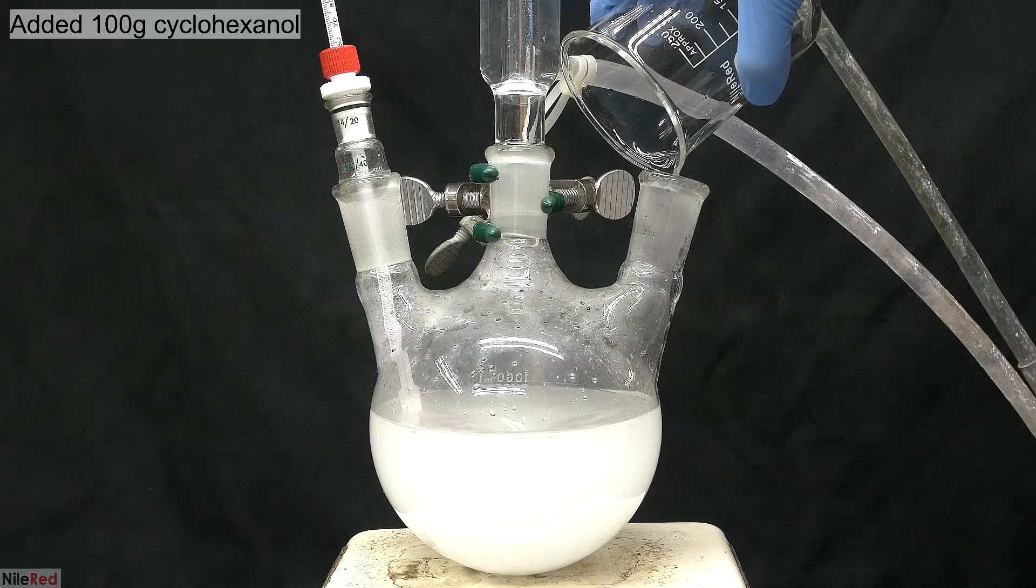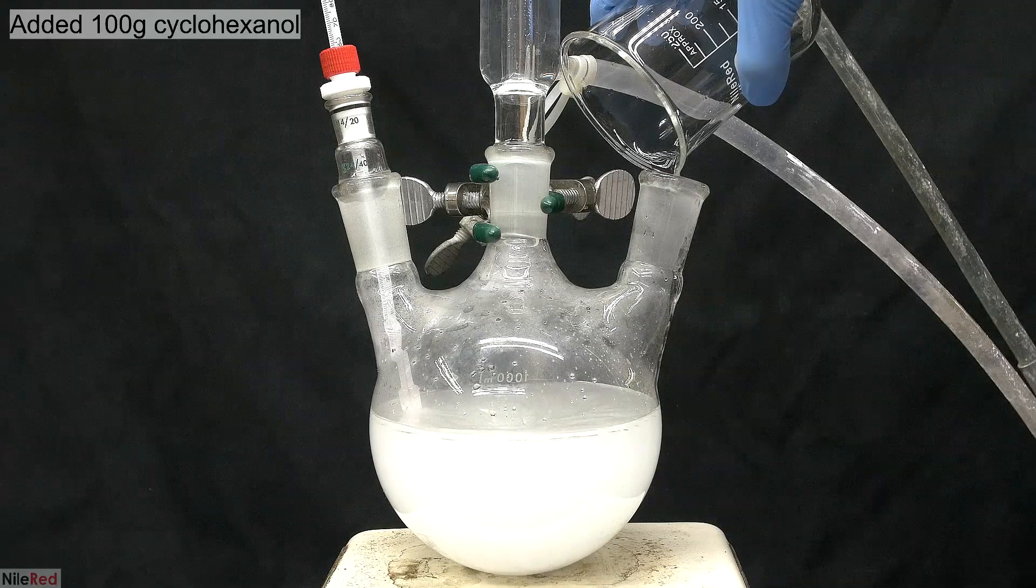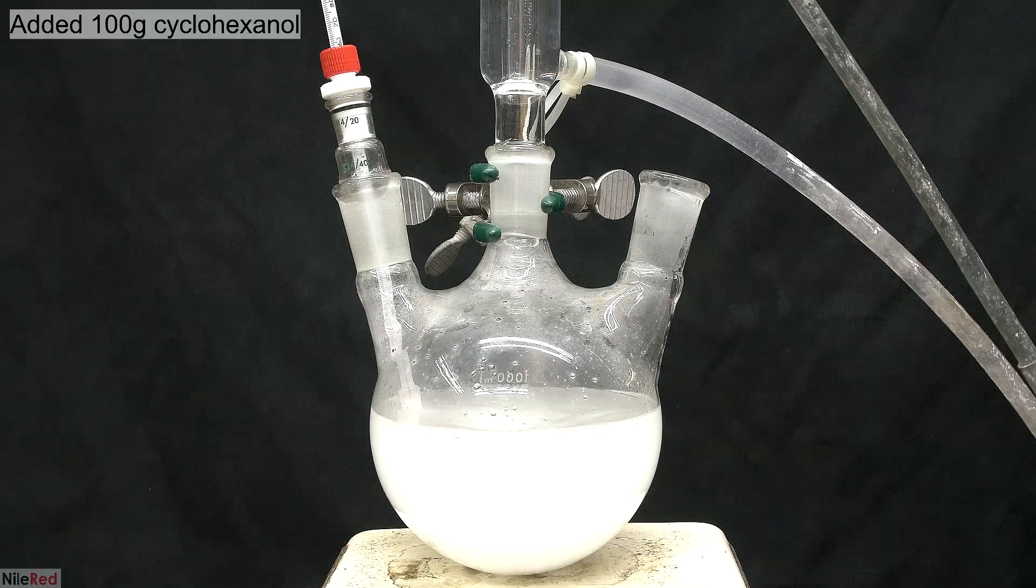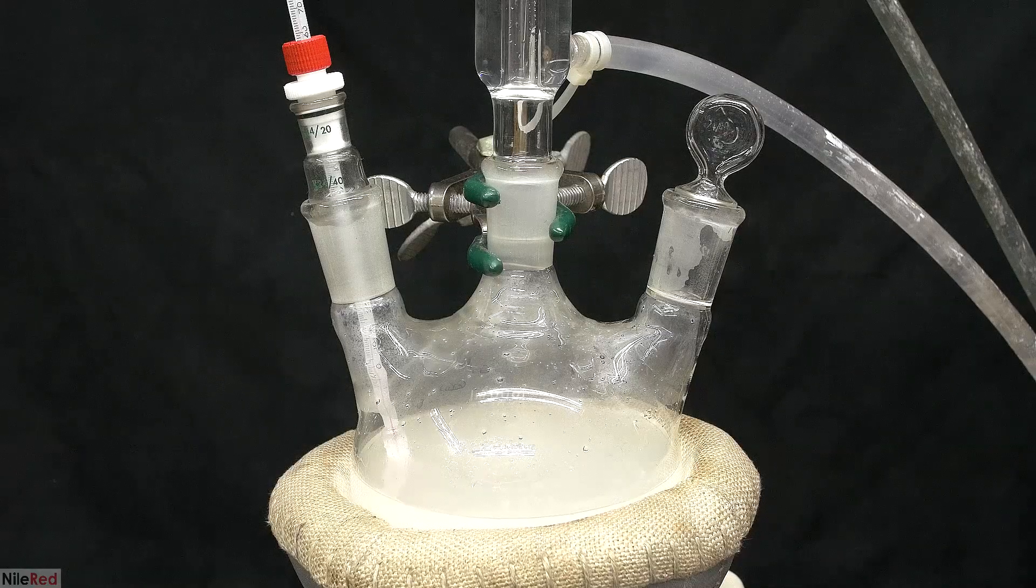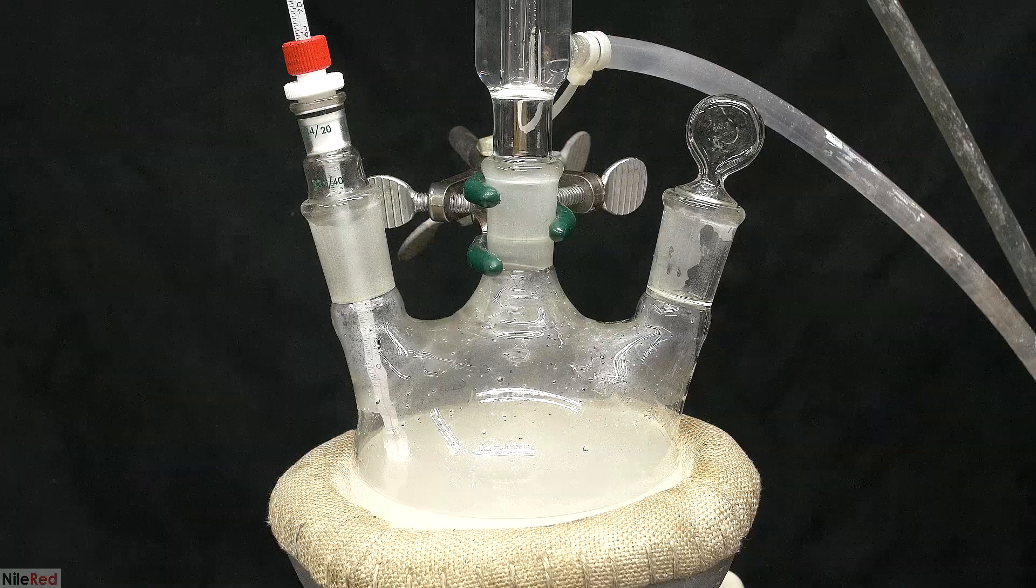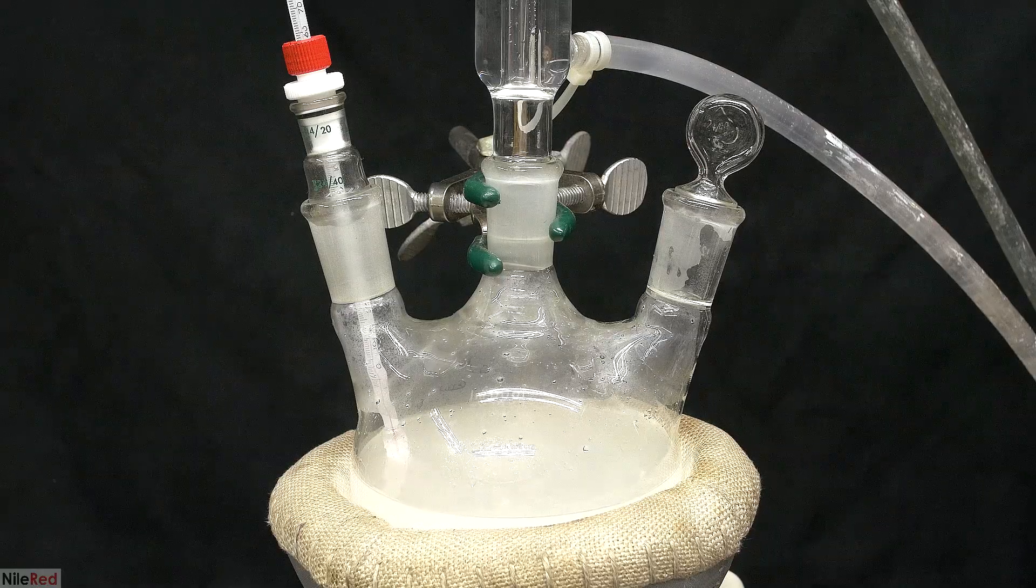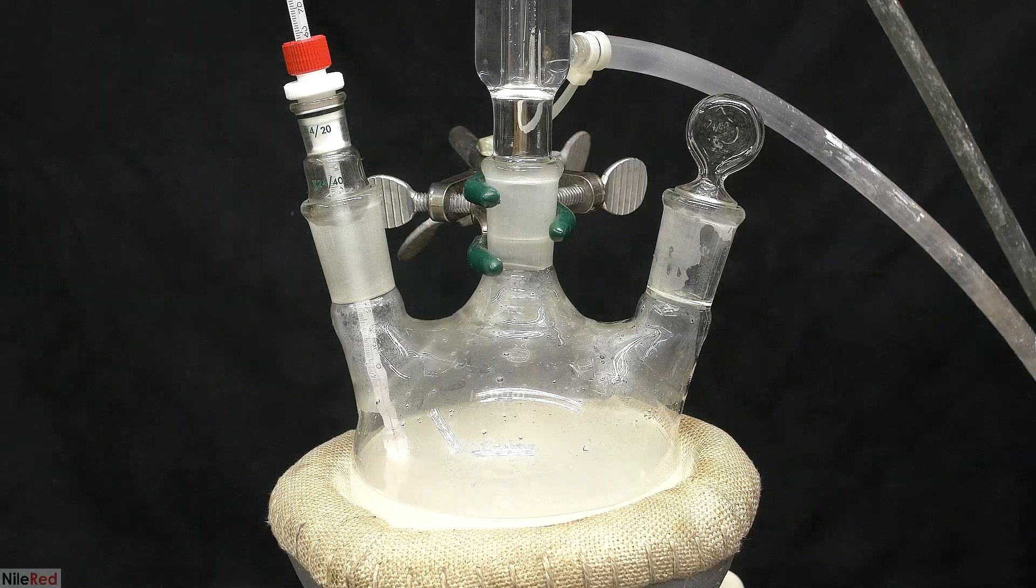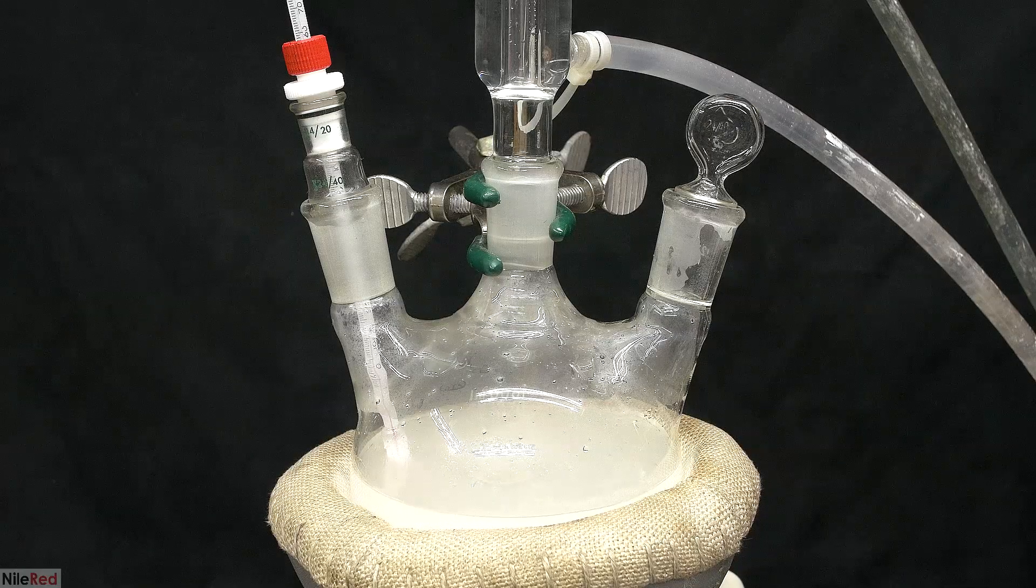If I turned off the stirring, it should clear up, and the cyclohexanol would separate as a layer above the water. The reaction doesn't really happen at room temperature, and to get things going, we need to heat it up. The target temperature is 90C, and I need to hold it there for about 20 hours.